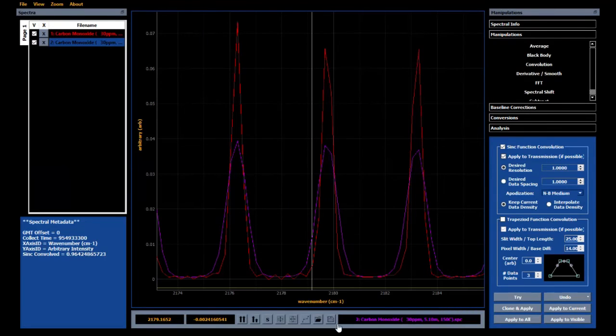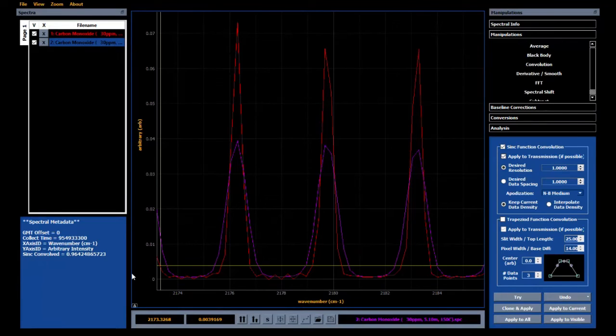And then we can go ahead and hit this save icon to save that out and use it for something to come next. Thanks, I hope that made sense.